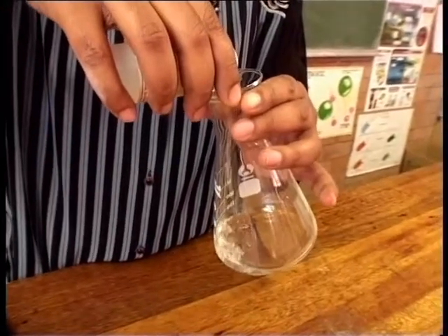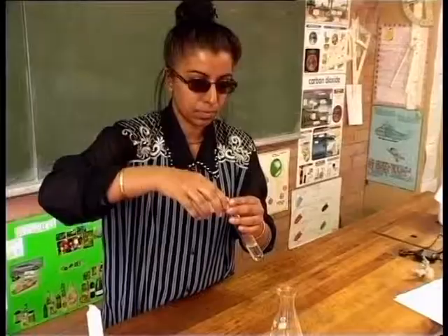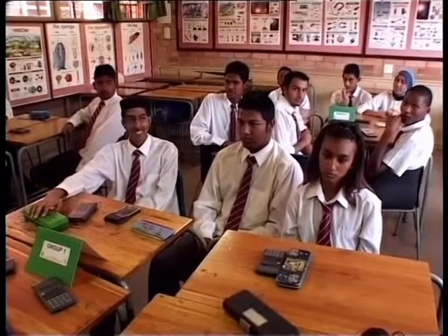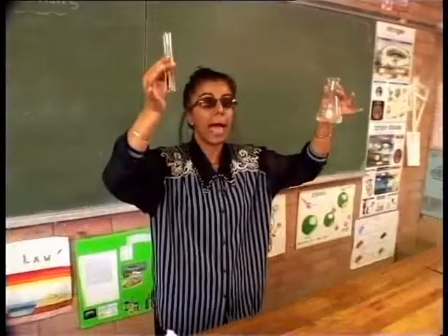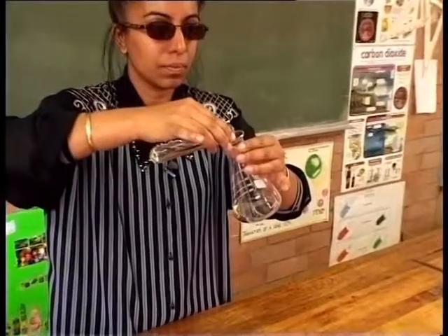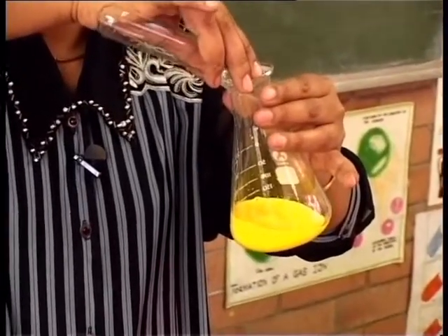The teacher begins this part of the lesson with a practical demonstration. She pours a solution of lead nitrate into a glass container and potassium iodide into a test tube. What do you think will happen if I mix these two? A chemical reaction will take place. Ms. RATILAL tests their predictions by mixing the solutions. What happened? There was a color change.